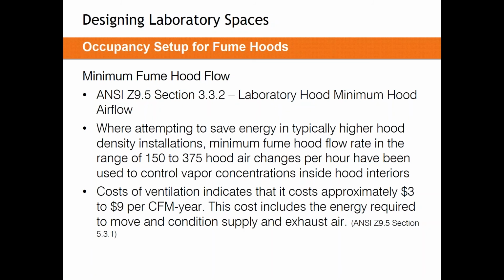Why is this so important? Remember, every CFM we exhaust costs us money. The estimation in ANSI Z9.5, depending on your market and your design for your mechanical equipment, is a single CFM costs between $3 and $9 per CFM per year.